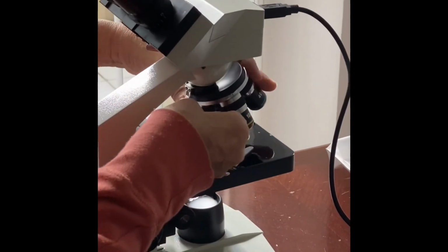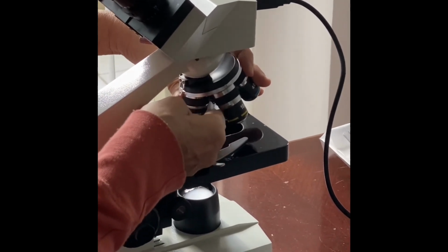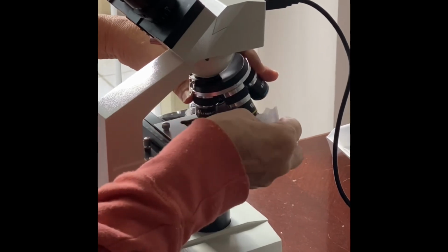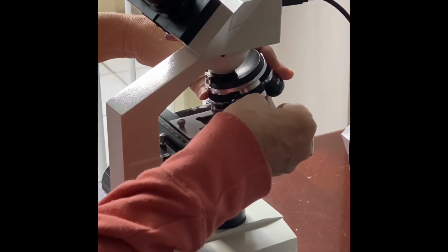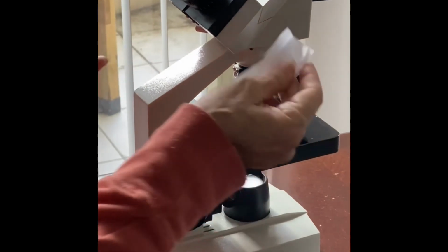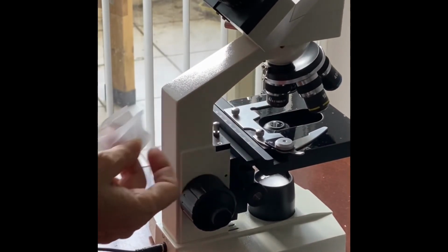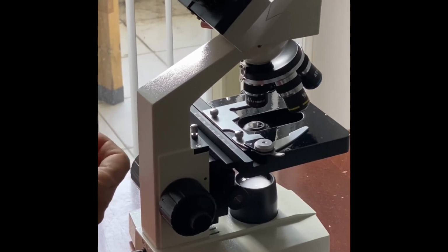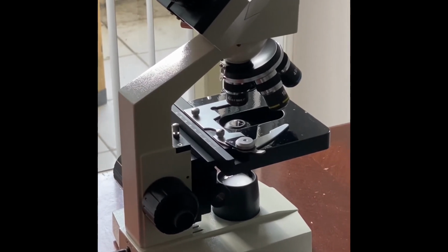Next, I'm going to clean the objectives. I use a little bit of lens paper to clean off any water that I might have gotten on the microscope. And the lens paper is the same lens paper that you use on your glasses. You can get it in a supermarket.